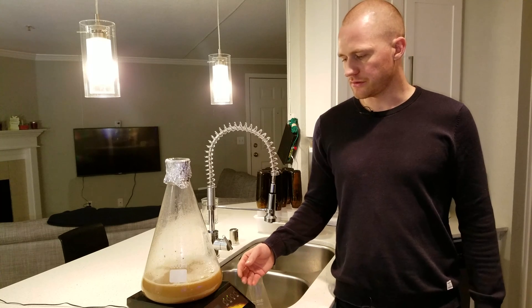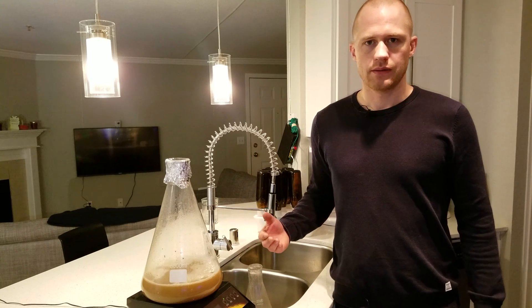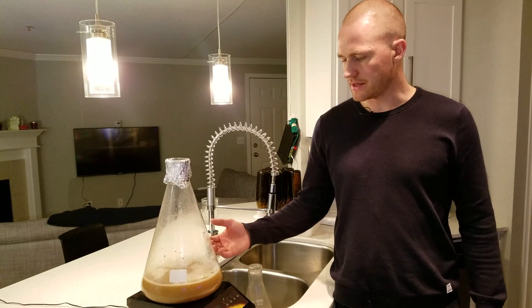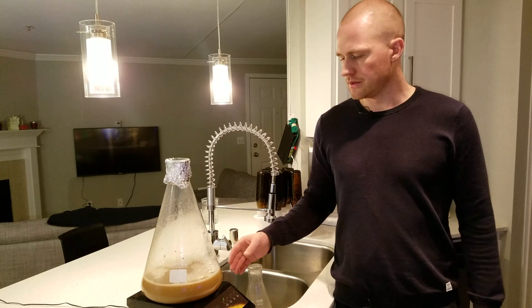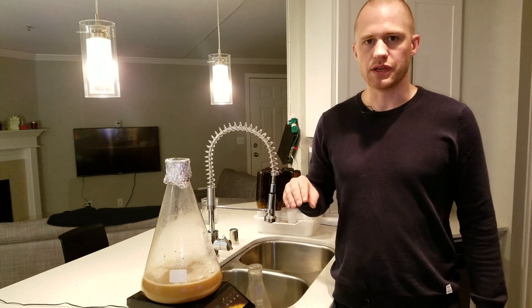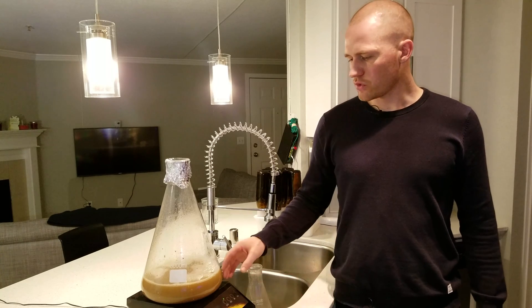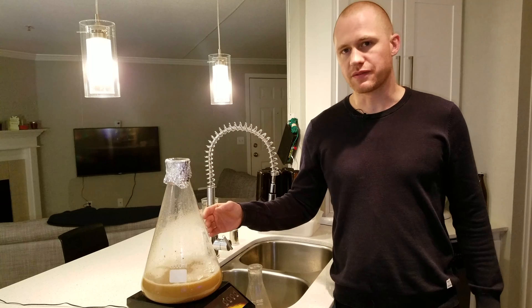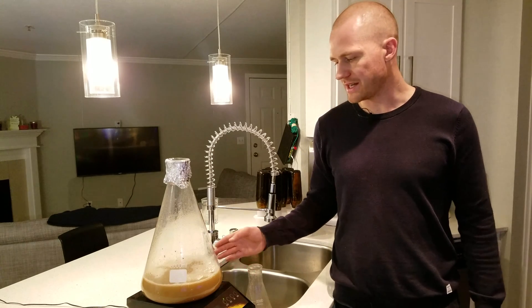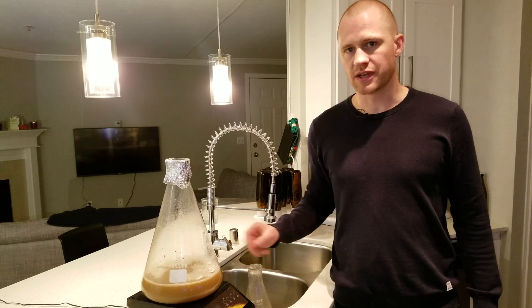Another thing you can do is let it go through the normal fermentation, then crash it and pick the yeast that's in the middle of your slurry. That way you get rid of whatever is on the bottom and whatever is on top. That doesn't really work in an Erlenmeyer flask that has this wide of a base, so for this one I would probably just go ahead and top crop it.